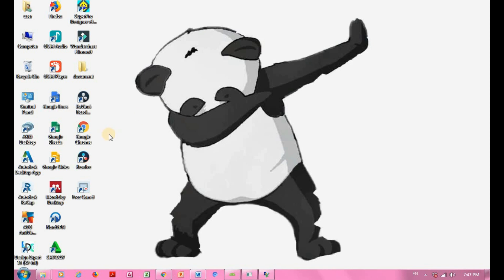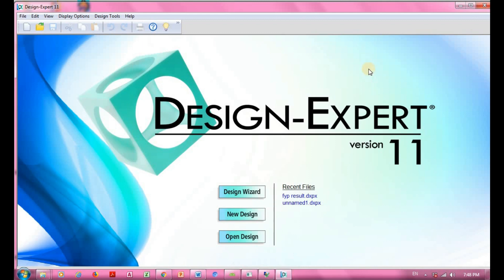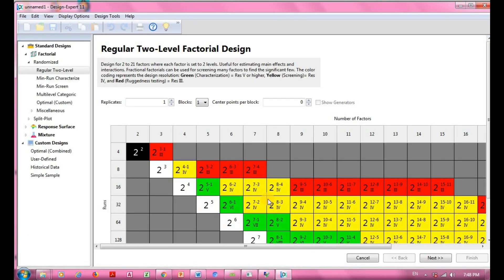Without further ado, we're going to launch Design Expert 11. This is the layout of the software. Now we're going to go for a new design — click on it. These are all the design types available in this software. You can go for numerous types of response.